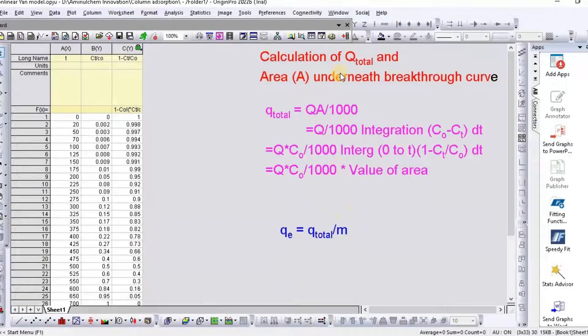Now I will show you how to calculate Qt total and area underneath breakthrough curve using Origin Pro.